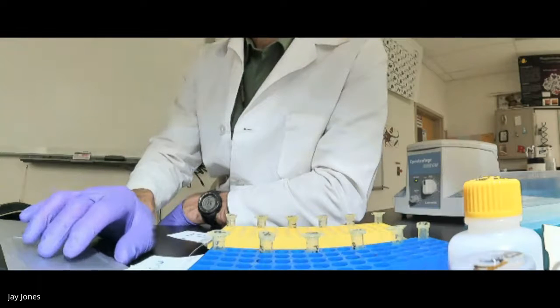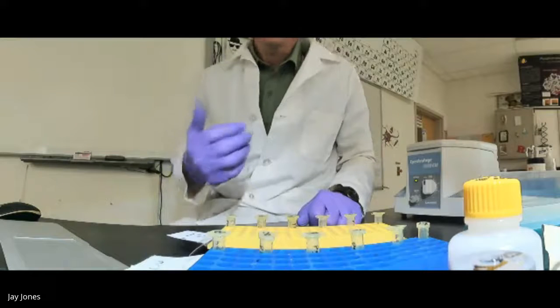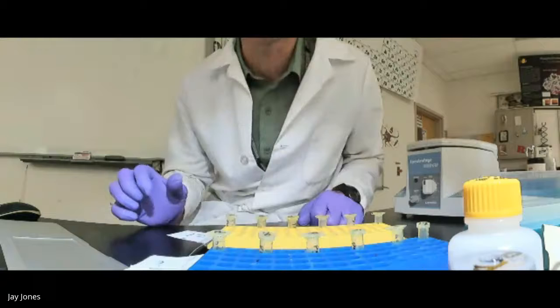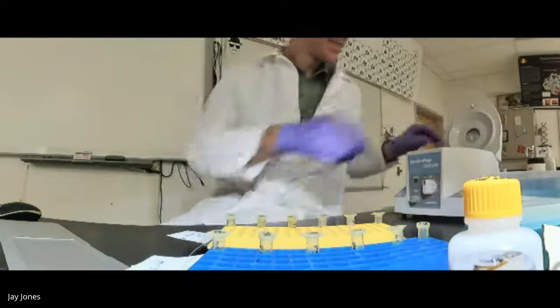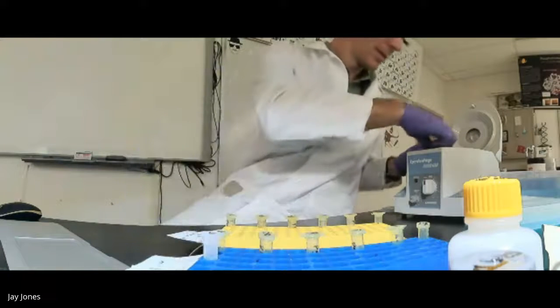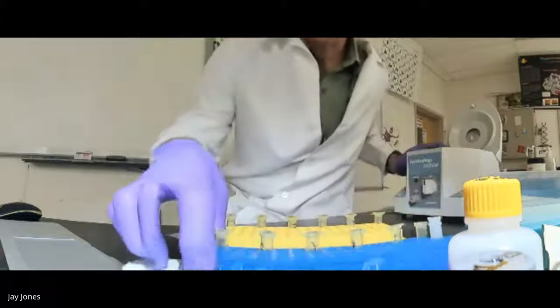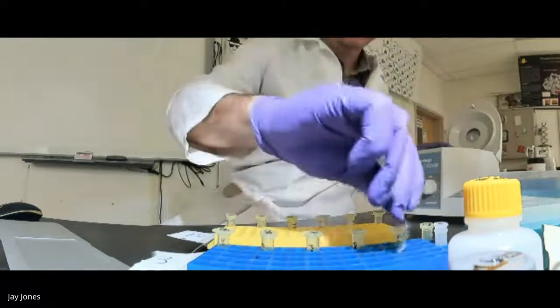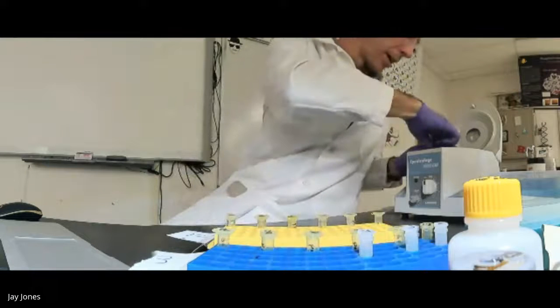Here we go. We're back. So this is done. We pulled that liquid through the column, and the column does one thing really well. What does it do? Anybody? What does the column do?